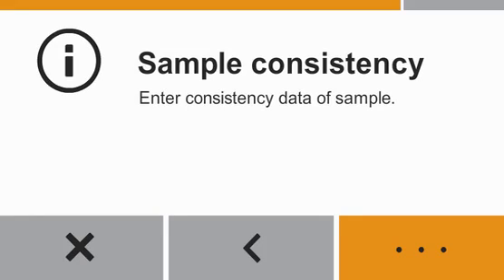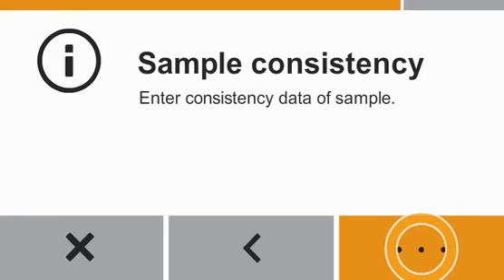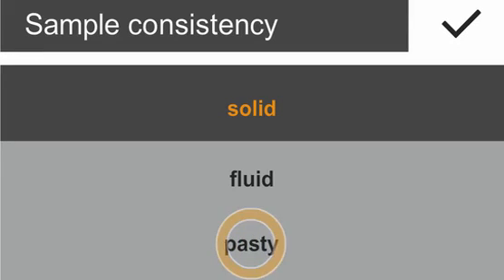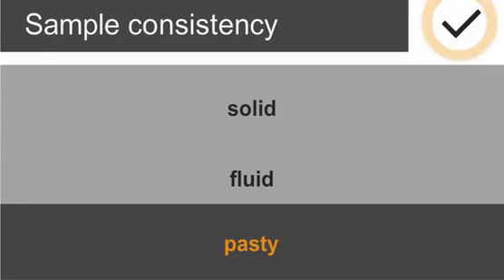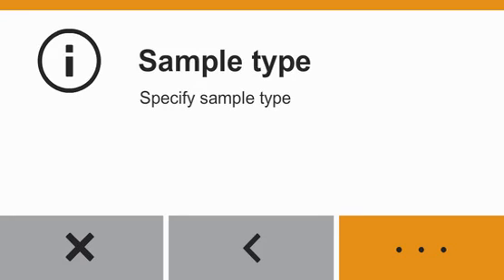Now, please enter the sample consistency. Ketchup has a pasty consistency. At the last step, select the type of sample: organic or inorganic.